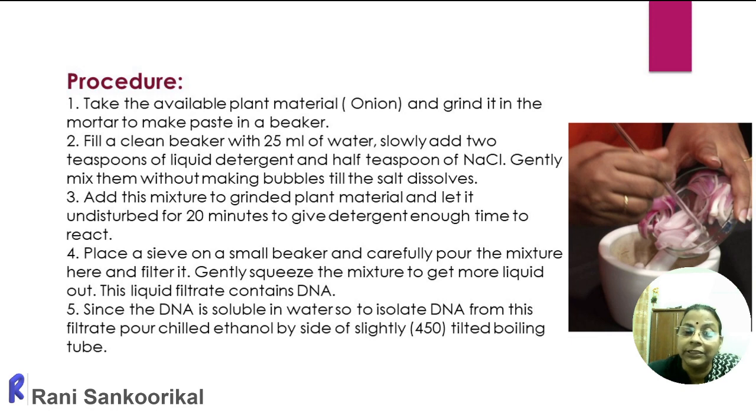Then keep that for about 5 minutes to settle, and also to separate, that separation of DNA, or coming out of the DNA from the material. You have to wait or allow it to rest for 5 minutes. And after 5 minutes, what you have to do?